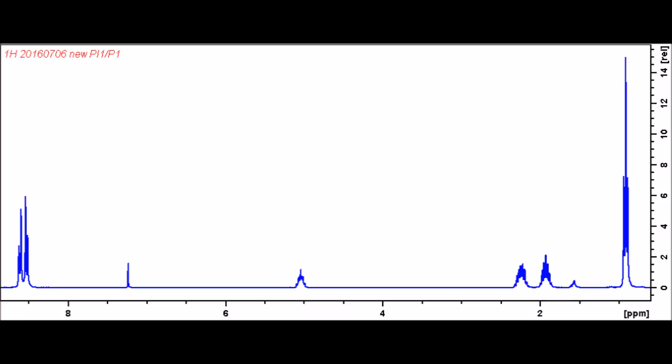These peaks correspond to chloroform and water respectively and are from the solvent that the NMR was run in and are not due to impurities in the product.